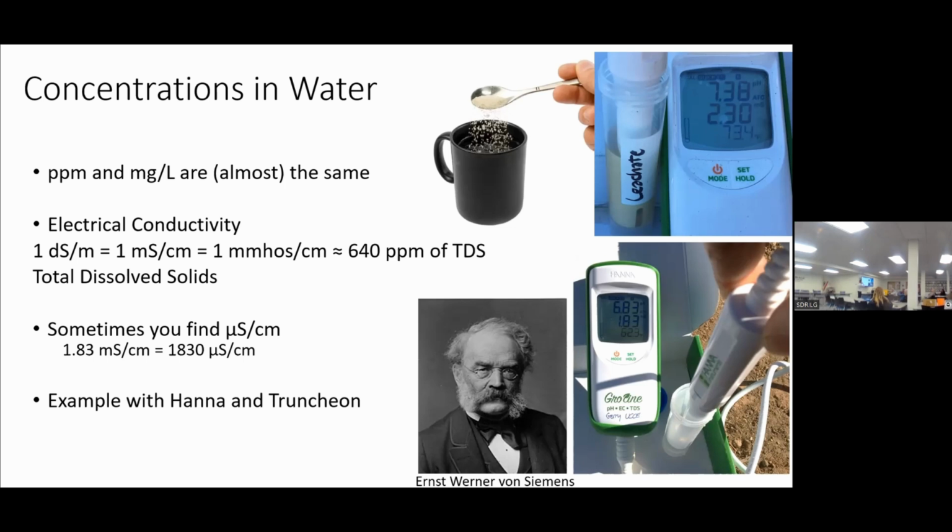Yeah. You can also use a trick that is called electrical conductivity. What is electrical conductivity? Greg, what is electrical conductivity? How, say, a liquid conducts electricity. It's the ability of a liquid or of a solid or of an object or of a material to conduct electricity.